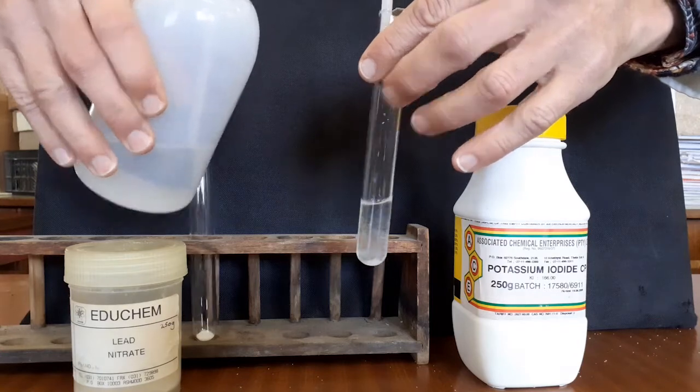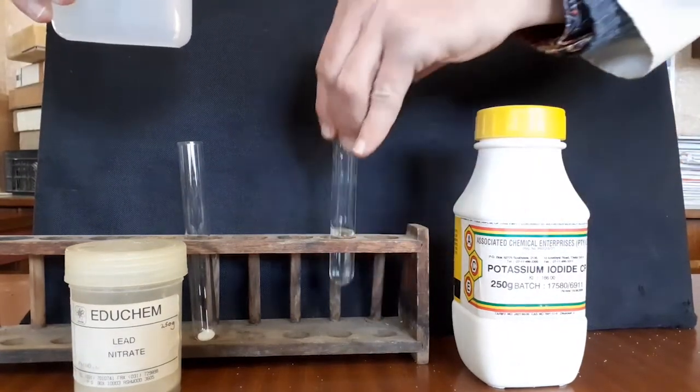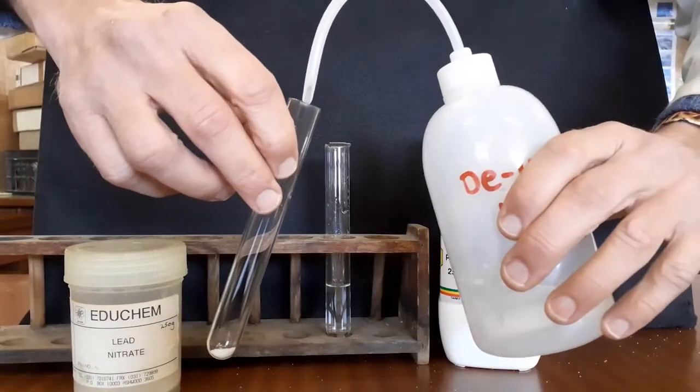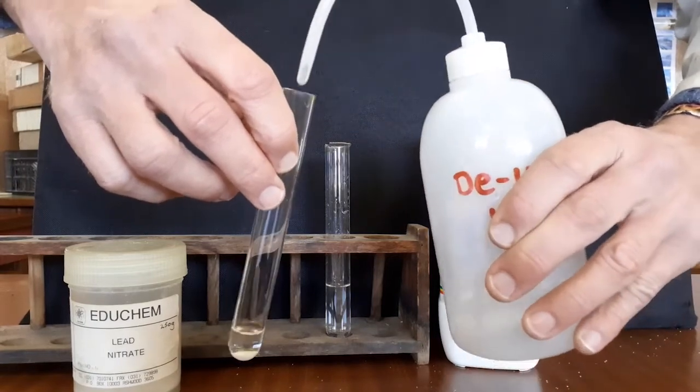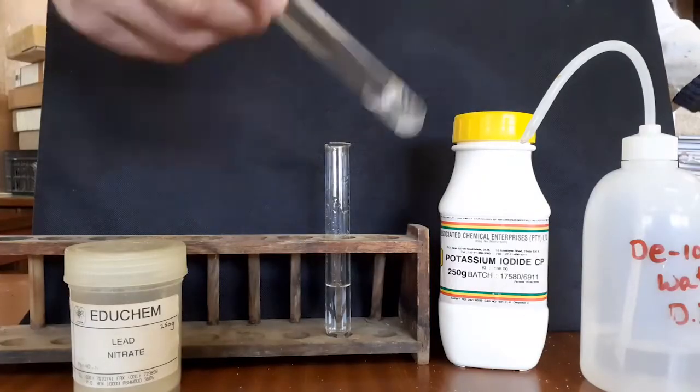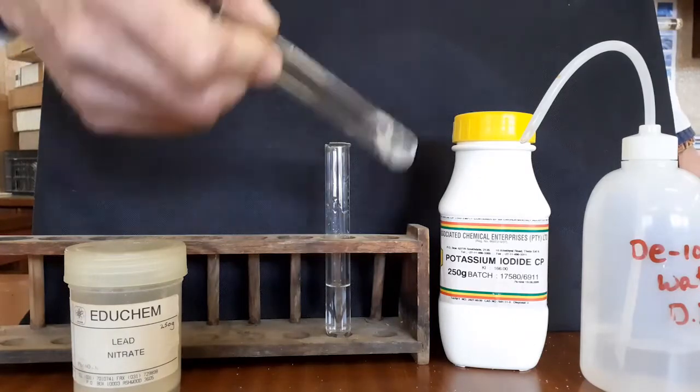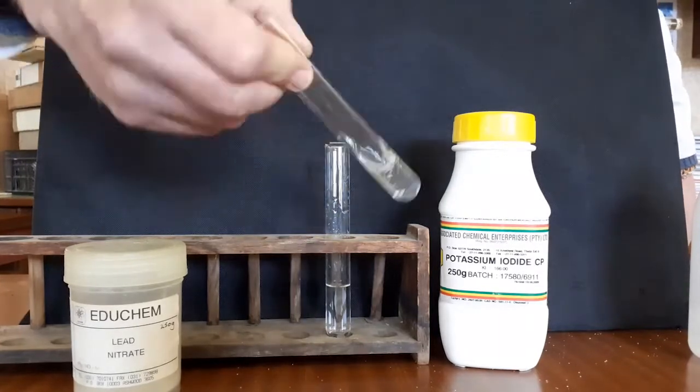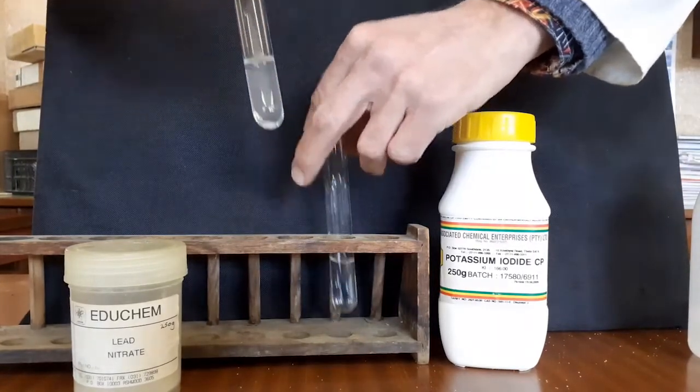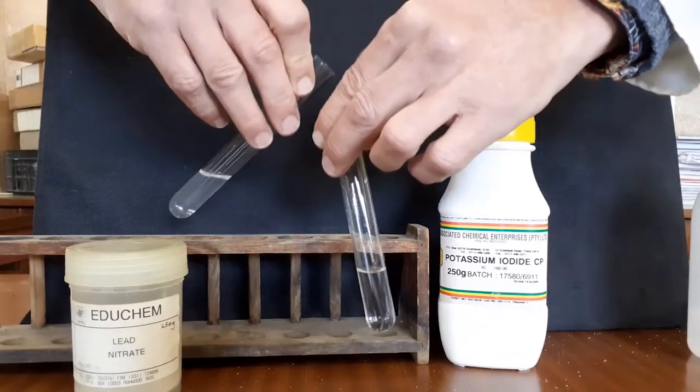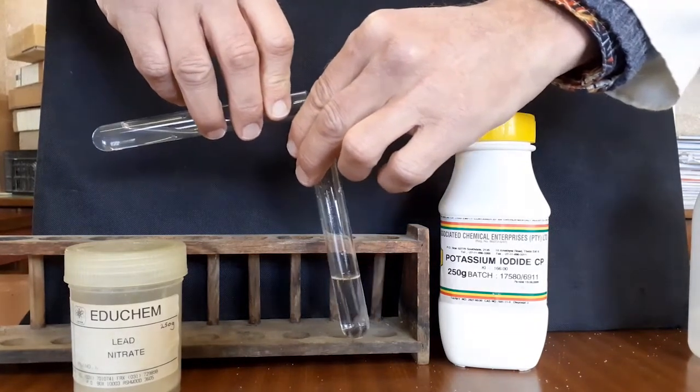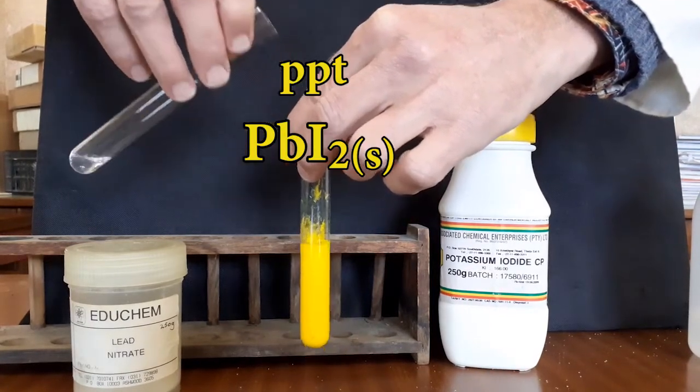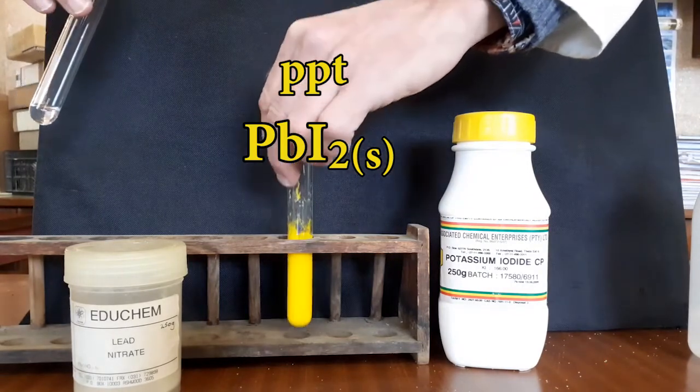Here we have potassium iodide salt. We dissolve these in deionized water. And here we have lead nitrate salt. Even heavy metal salts can dissolve as nitrates. Mixing them.